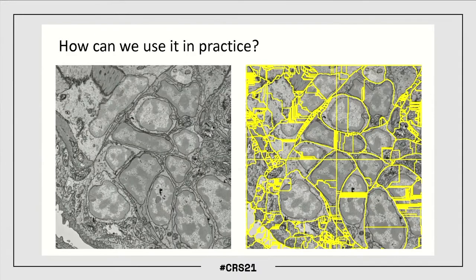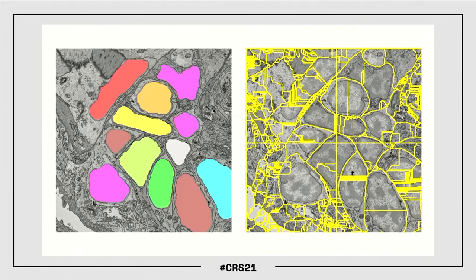What kind of priors can we encode in an image like we have from the electron microscopy? Here you can see the raw data, and on the right, these are the superpixels that we are working on. And then, well, we know, for example, that we can segment nuclei in these images. Because the chromatin texture looks very different from everything else, nuclei are actually fairly easy to segment. So we can segment the nuclei, and then we can remember our biology and say that every cell should only have one nucleus. So then you can introduce these kinds of forces that go away and push all the other nuclei away.